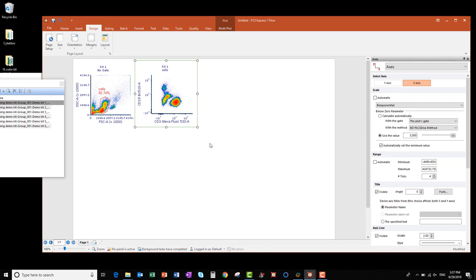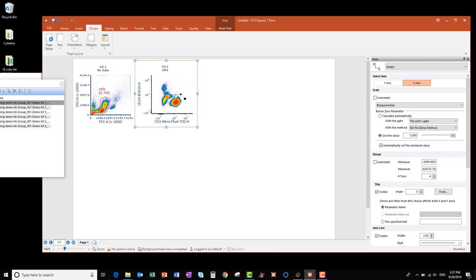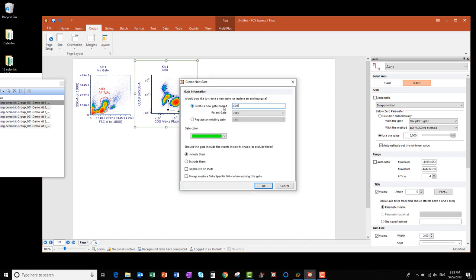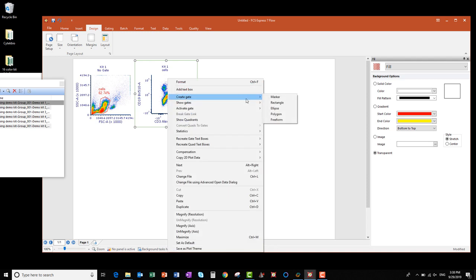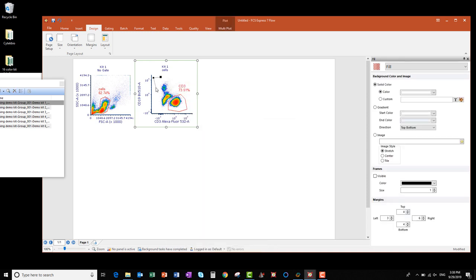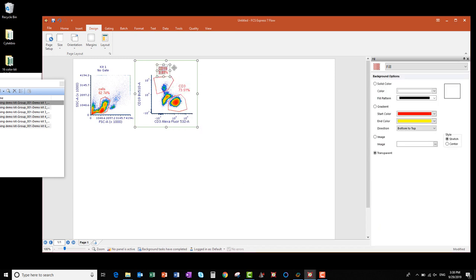Now I'm ready to add my next gate, so I right-click on the plot, select Create Gate, and click Polygon. I'm going to draw this gate around the CD3 positive and CD19 negative events and click to close. I'll name this one CD3, and if you want to change the gate color, go ahead and do so. I can relocate the gate name by clicking and dragging it around on the plot. Now I'm going to do my CD19 gate — same procedure. I'll name this gate CD19, change the gate color if you'd like, and click OK. I want to relocate the gate titles on the plot, so I'm going to click and drag them to where I want them to be.